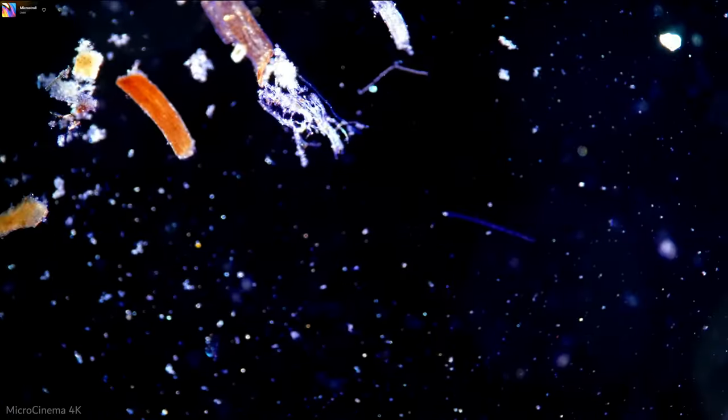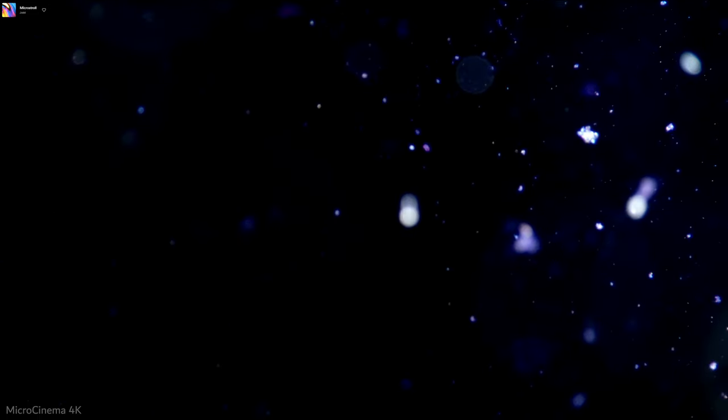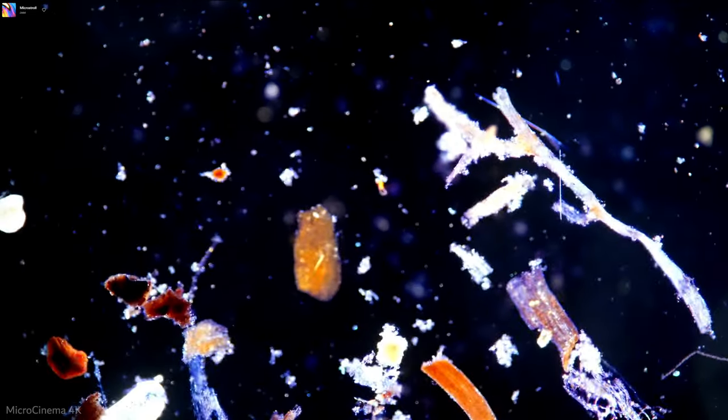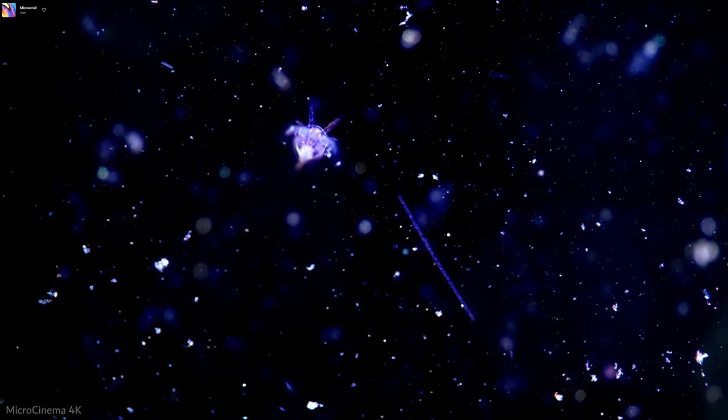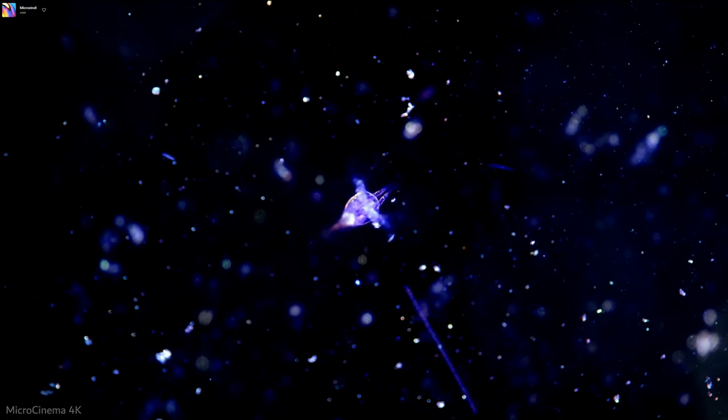I've definitely been considering, my microscope has a 100 watt halogen. Is there a 200 watt halogen I could adapt into this to get more light? But often, if you have a microscope that just has a 1 watt LED or something, oh, a Swift Stellar one. Yeah, you should have plenty of room if you want to modify that with a high power LED.